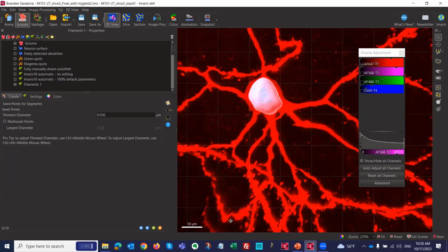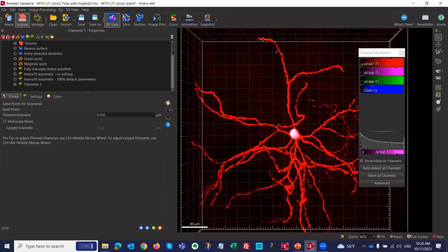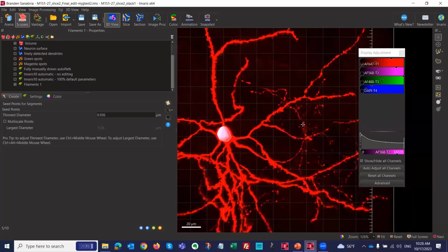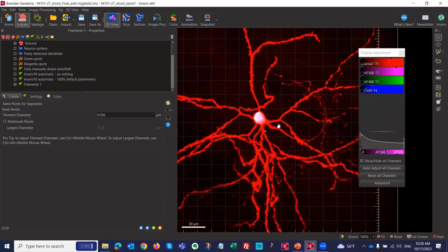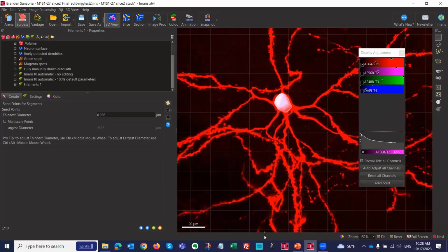Big pro tip here, make your life easy, meaning if you see like this, the minimum is maybe 0.9, the maximum is 1.1, then don't use the range, just use one diameter. It's really if there's a big gap. But if it's very close, like you can see here, there's not too much variation, unless I maybe take those thin ones, but as I mentioned, I'm not going to take those right now. So in this case, just use one diameter, make your life easier, okay? But you have the possibility.